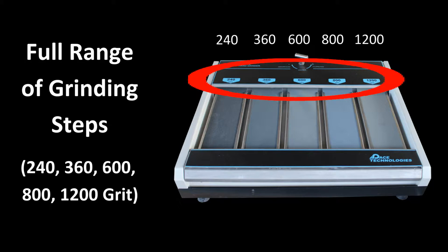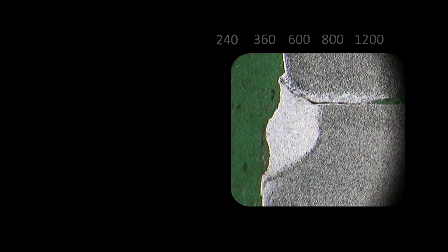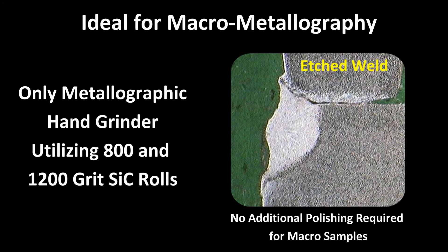Advancing the abrasive rolls is very easy and fast, so new abrasive can be used as needed. For preparing heat treated or welded samples, the Penta 5000 with its finer grinding stations in many cases provides a good enough surface finish for doing a quick, inexpensive analysis.